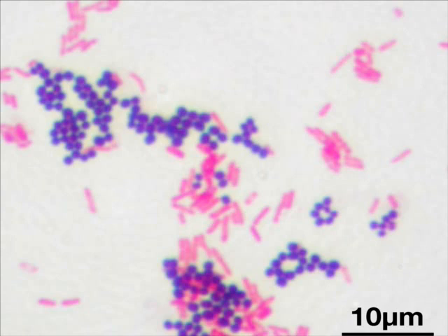Regarding the arrangement, the violet color organisms are arranged in groups or clusters, whereas the pink color organisms are scattered in arrangement. So we have observed all these shape, color and arrangement.